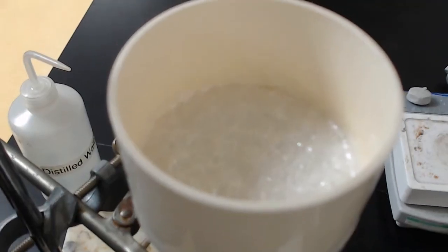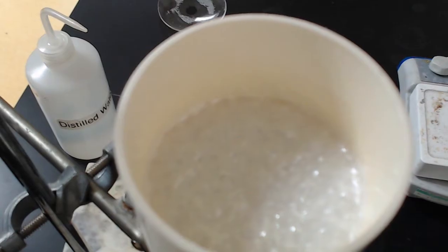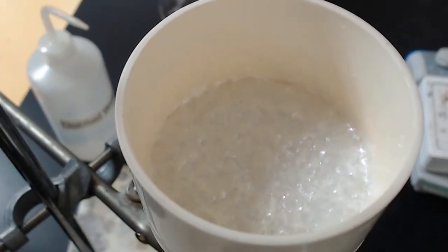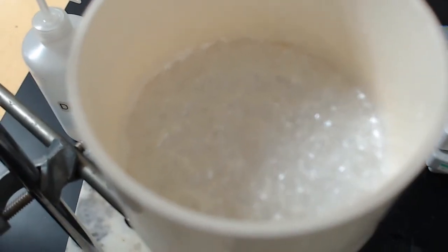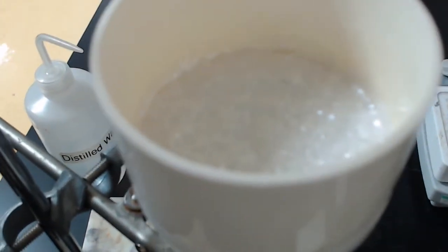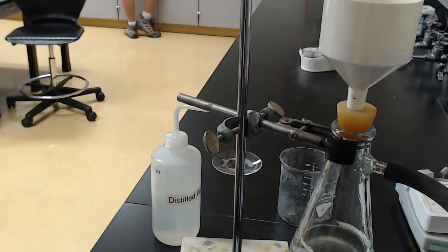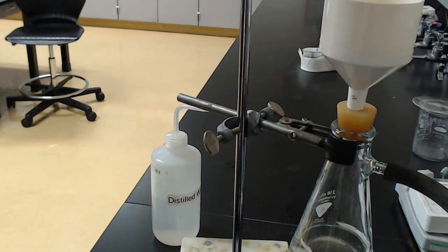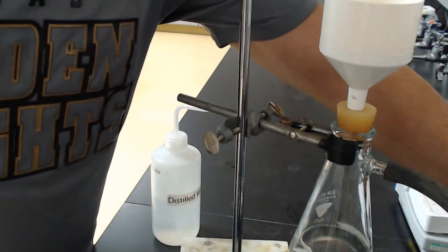Realistically, in a research setting, I would probably let it sit for overnight. Just to make sure that no water was there. Well, we'll see how good our drying process was later on when we get our melting point, right? So, we're going to let it sit here for 10 minutes. Not going to make you guys watch it, but it'll be 10 minutes. All right, this has been sitting on the vacuum now for about 10 minutes. I'm going to go ahead and cut it off and see what it looks like. And get a weight.